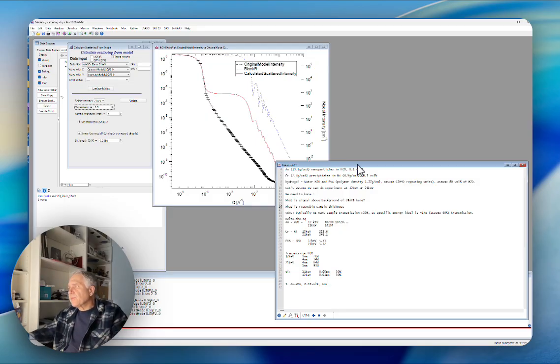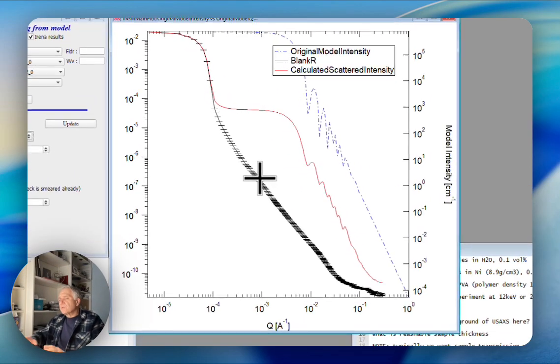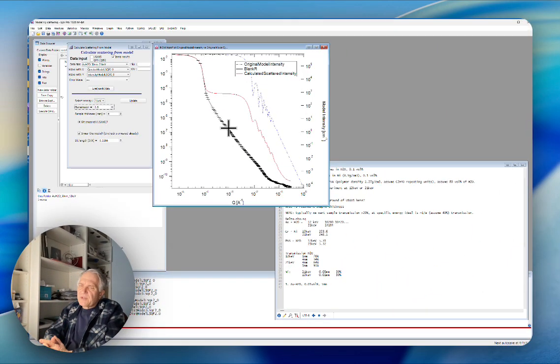So anyway, if you need to know if your samples are measurable, what we did here today is we calculated the contrasts using the scattering contrast calculator for materials which contain no heavier elements than the standard carbon and things like that, and nitrogen. Then you don't have to worry about the anomalous calculator, but normally it's actually convenient to do it in the anomalous calculator.